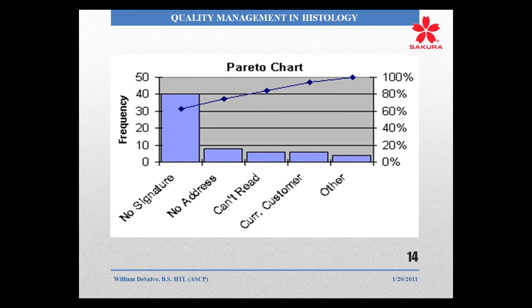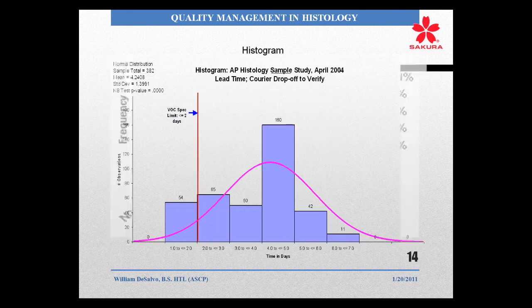Pareto charts, you may or may not have seen these, but you need to understand how to chart out and trend. Be very visual for yourself, if you're helping to organize this plan, and visual for the people who are participating. A simple chart, what's that term? A picture's worth 1,000 words. Putting together a chart and posting these and getting everybody involved can help a lot of people understand quickly what issues are and where we need to concentrate our energy. And again, these are just done to introduce them to you.